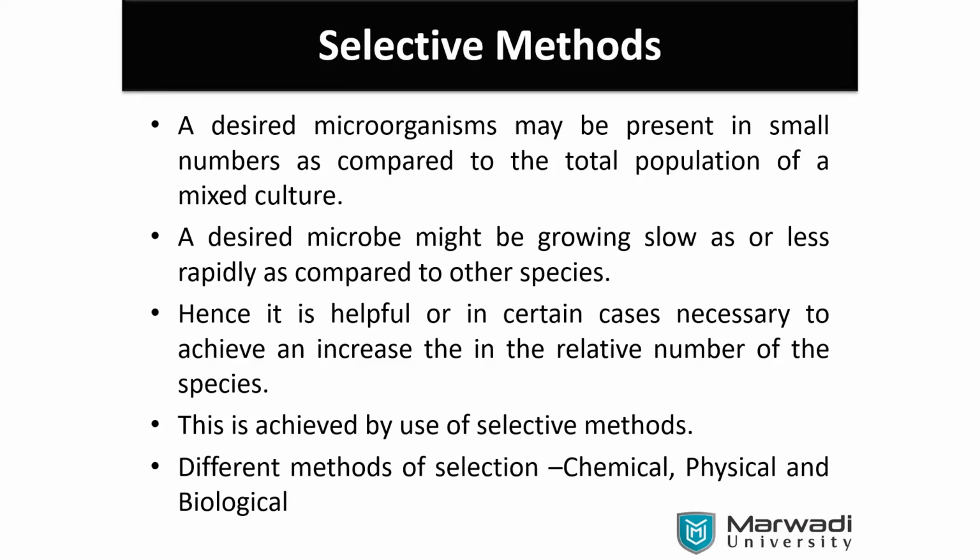And third, where we have incubated. During the incubations, there were fungal spores and others growing inside the incubator. So our plates got contaminated. So I think the second and third possibilities are more. And that is why we have shifted. Earlier we kept them in 518 to 517, the different incubators.